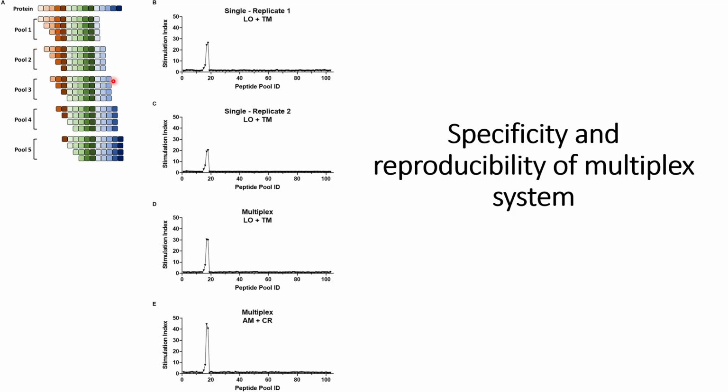They showed this using peptides from the pre-pro insulin, for the single fluorescence 8XNFAT reporters and also for the dual or multiplex 8XNFAT reporters in different fluorescence channels.